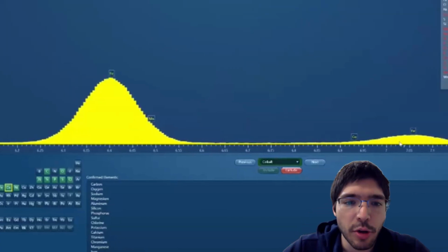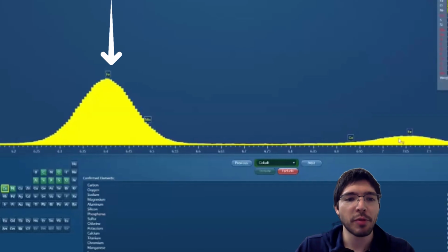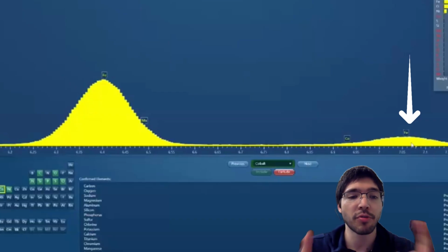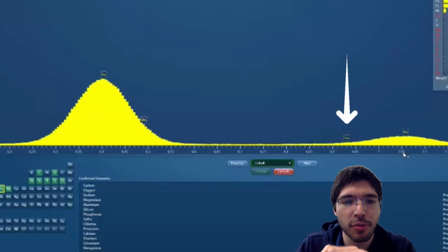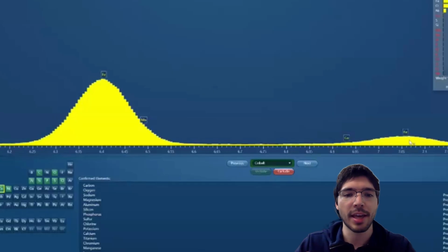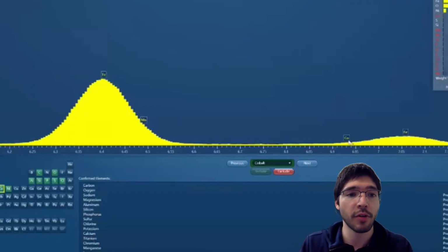Yeah, I mean, it could. For example, I'm looking at those two peaks you see on the left. The left one is called the iron K alpha peak. The peak on the right is called the iron K beta peak. These are two energy peaks that we pick up that are characteristic of iron in our sample. But in the middle, there's a small peak where the cobalt K alpha peak interacts with the iron K beta peak. And because using EDS, we can't distinguish the two because our spectral resolution is not very good.